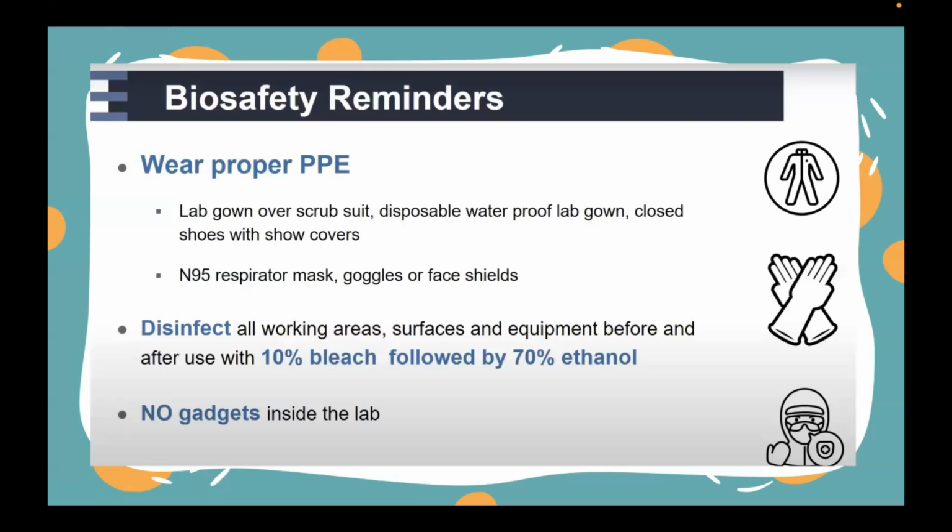If nasa St. Jude College Laboratory tayo, yung mol bio natin doon, we don't need to use N95 respirator mask kasi ang mga pinaprocess natin doon, mga DNA samples lang, kagaya ng mga makukuha natin sa ating tissues, sa ating mga hair roots, sa mga tissues ng mga fishes, ng mga chicken. So no need to use N95 respirator mask.